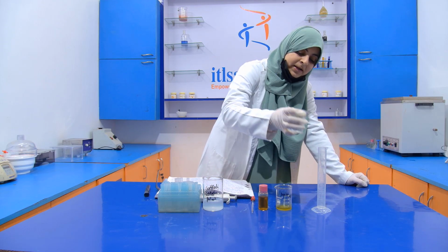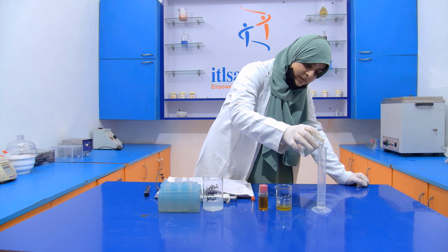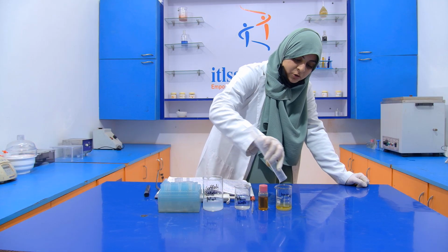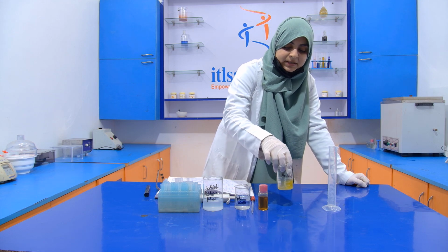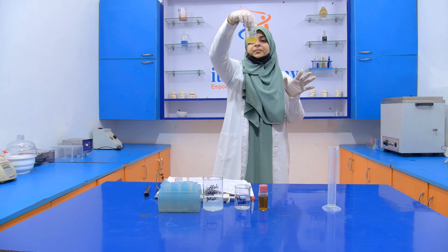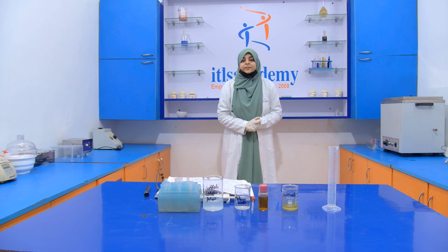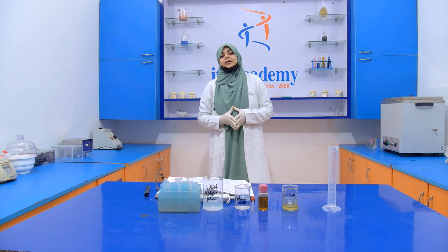The hot water will be taken with the help of this measuring cylinder. The temperature of the hot water is in the range of 70 to 80 degrees Celsius. See, there is no turbidity formed, which means that our sample does not contain any mineral oil.